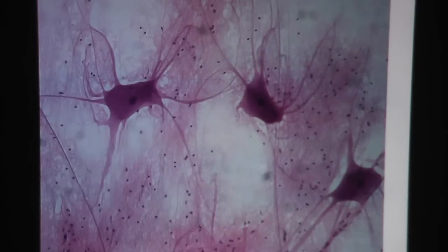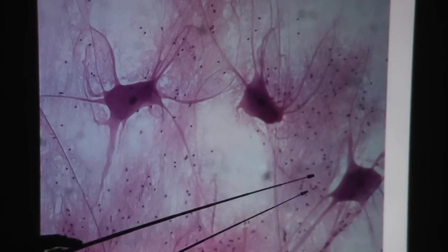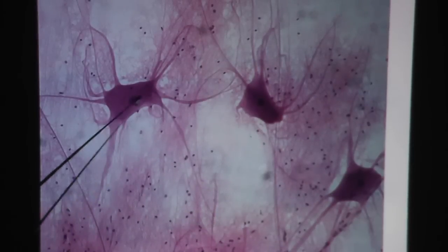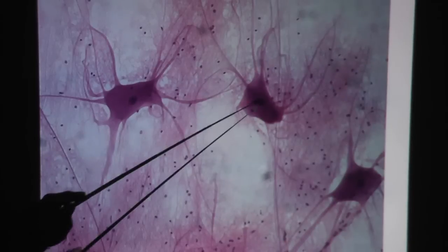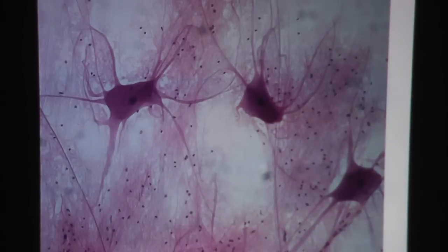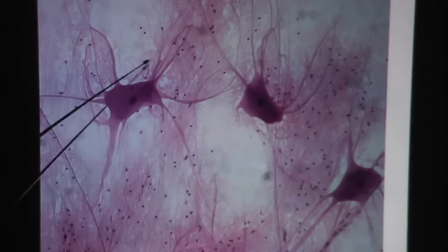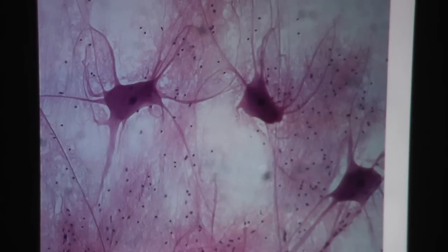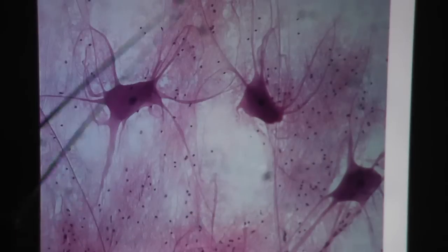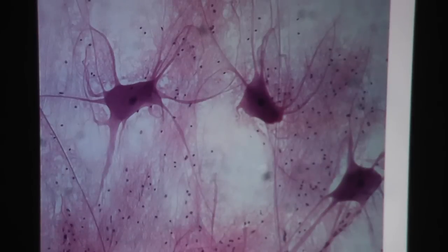More neurons — three to be specific. Great nucleolus visible, and there's a little bit of a halo effect around the nucleolus — that's probably the nucleus. Great processes coming out of this neuron. It's hard to say which one is the longest, so we'll just call them all processes. Also there's a scattering of neuroglial cells, because I can see there are nuclei.